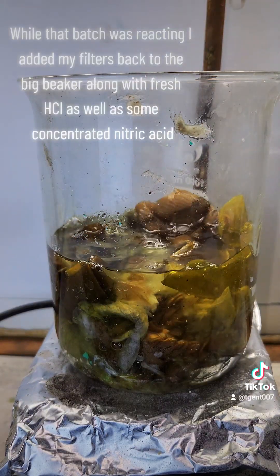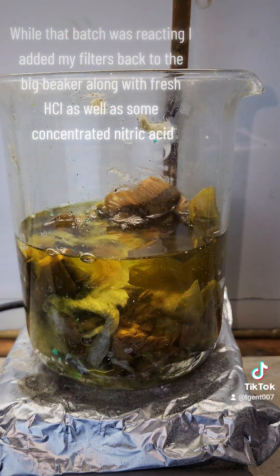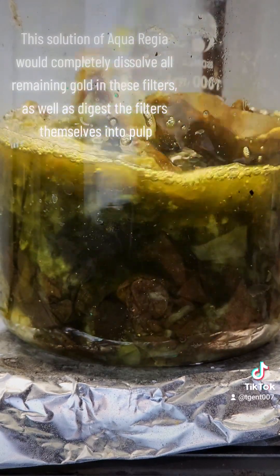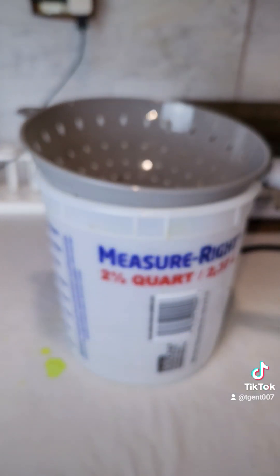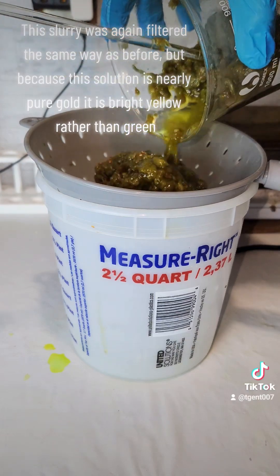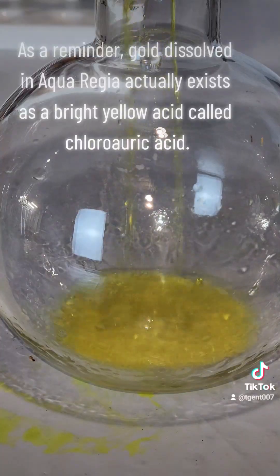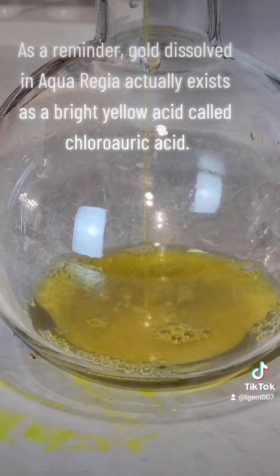While that batch was reacting, I added my filters back to the big beaker along with fresh HCl as well as some concentrated nitric acid. This solution of aqua regia would completely dissolve all remaining gold in these filters, as well as digest the filters themselves into pulp. This slurry was again filtered the same way as before, but because this solution is nearly pure gold, it is bright yellow rather than green. As a reminder, gold dissolved in aqua regia actually exists as a bright yellow acid called chloroauric acid.